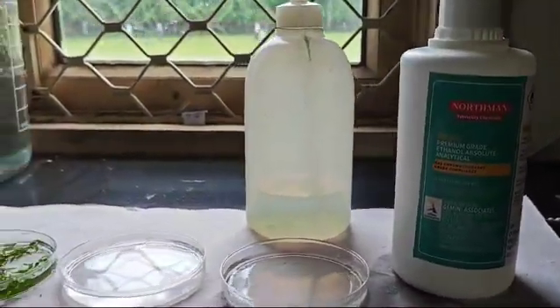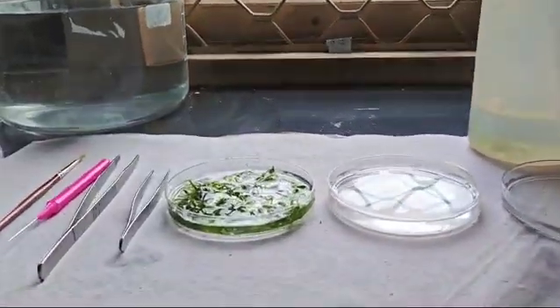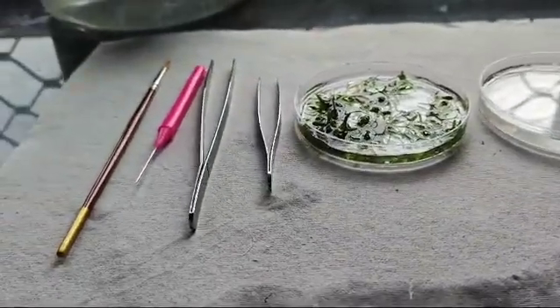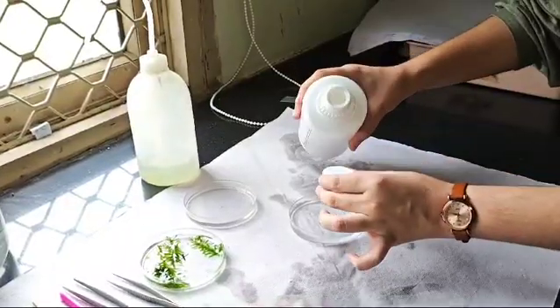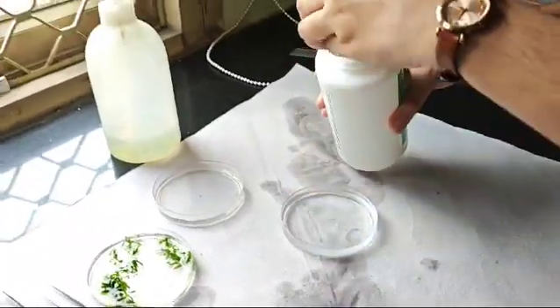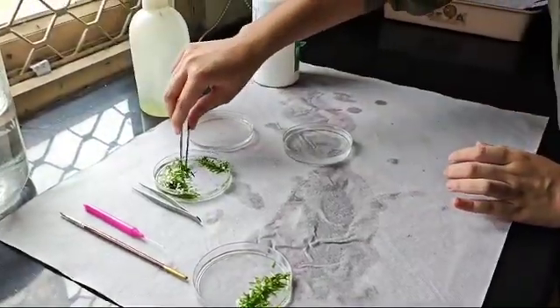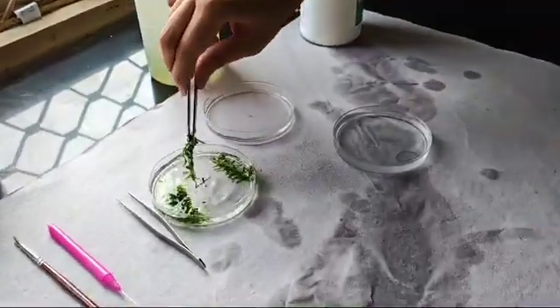The material we will require is ethanol, distilled water, some petri dish, pointed forcep, blunt forcep, pin and brush. Now, to a petri dish add some water and some ethanol and keep the hydrilla leaves in them for 5 to 10 minutes undisturbed.